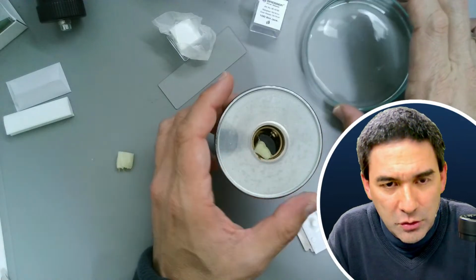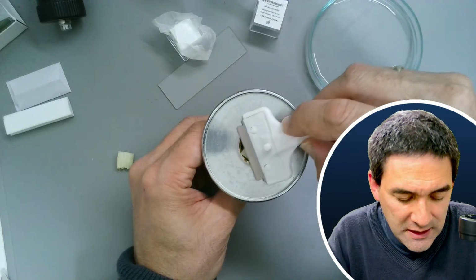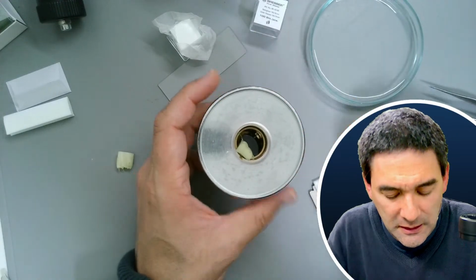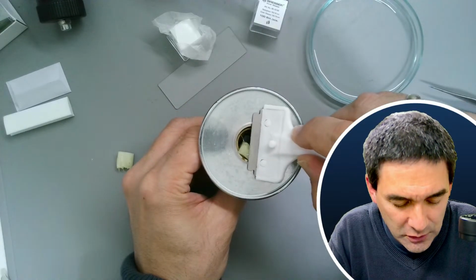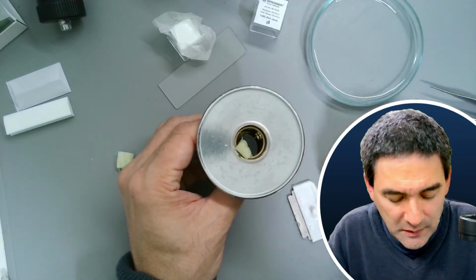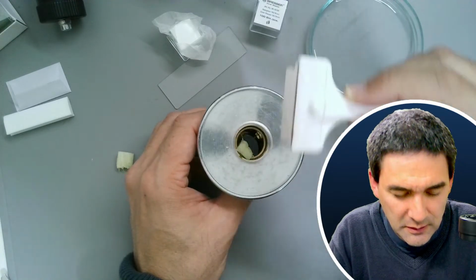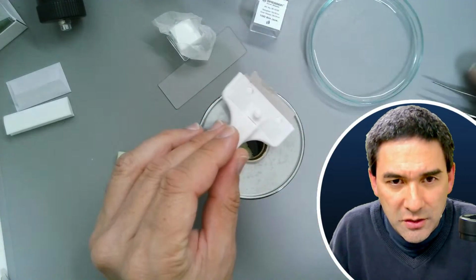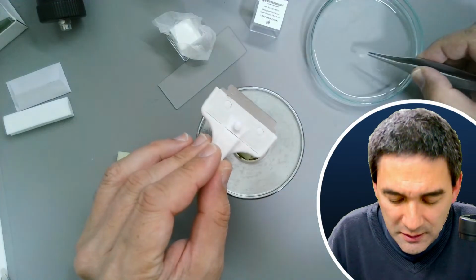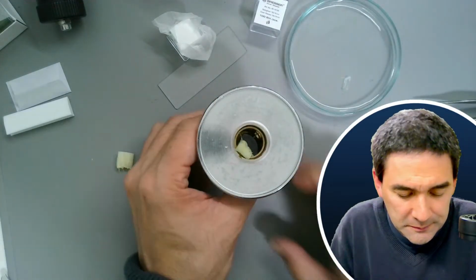Maybe it is a little bit too big. Then I turn it a little bit and test it again. You see that it was a little bit too low, so I have to turn it again. Usually I'm trying this with trial and error. I'm just scraping the surface here. We can try to pick it off and see, maybe not quite. Usually when you put it in here, it starts to spread a little bit better.